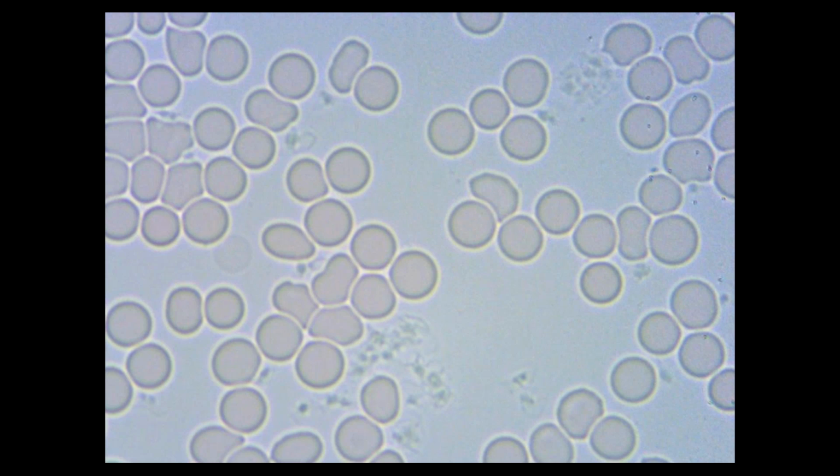Now this means that the video that you'll then see on the screen will really not be very smooth at all. Now these cameras are better suited to applications where there isn't really much movement in the object that you're viewing. Ideally, in live blood analysis, the camera should have a frame rate of at least 25 frames per second, which again narrows down your options in terms of high definition digital cameras quite dramatically.